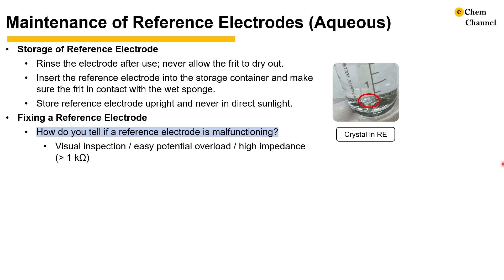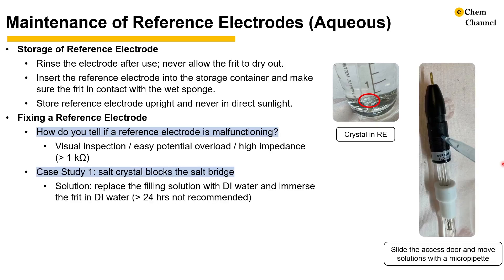If the electrode looks normal, you may also check the impedance. If the impedance is greater than 1000 ohms, there might be salt crystals clogging the frit. If clogs happen, we can dissolve them by replacing the filling solution with DI water and immersing the reference electrode in DI water. To replace the filling solution, slide the access door and remove and add solutions using a micropipette. Use plastic pipettes to avoid breaking parts inside the electrode. After the crystal dissolves, replace the DI water with the appropriate filling solution.